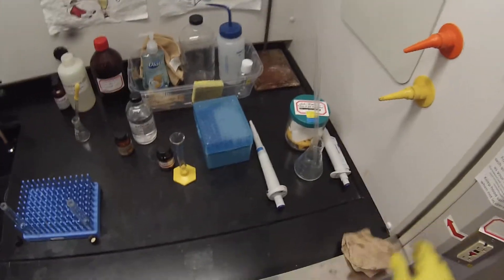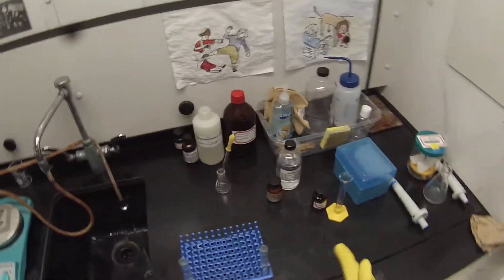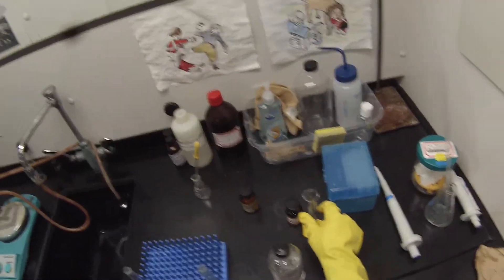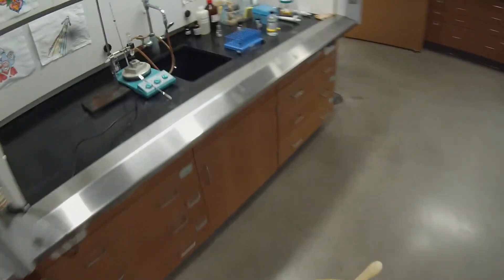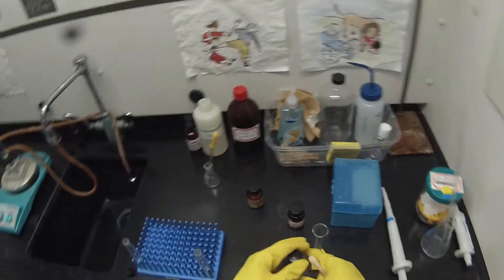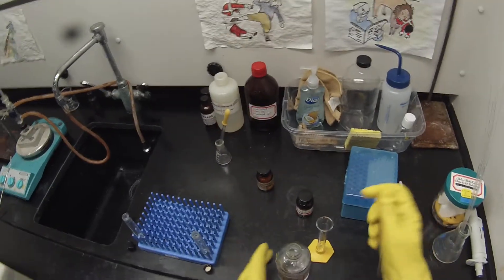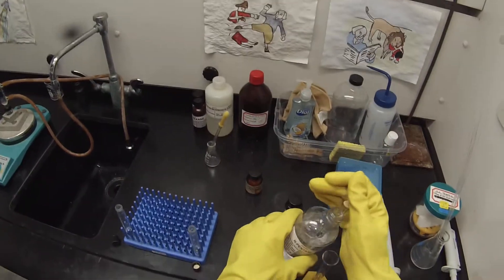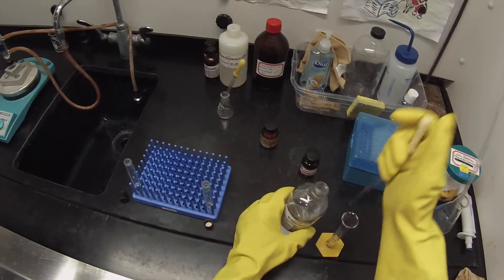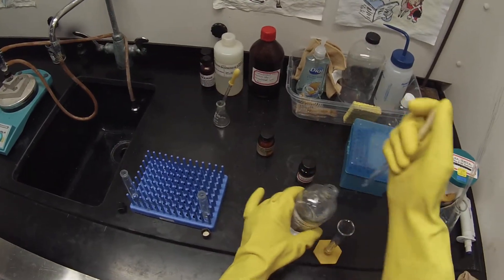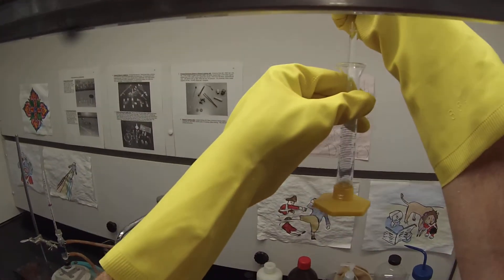So now before we add the t-butanol to the centrifuge tubes, we're going to add our extraction solvent, which is n-pentane. I'm going to grab another pipette and pipette bulb. And we're going to put about a milliliter of n-pentane in each. I'll measure out 2 milliliters of pentane.